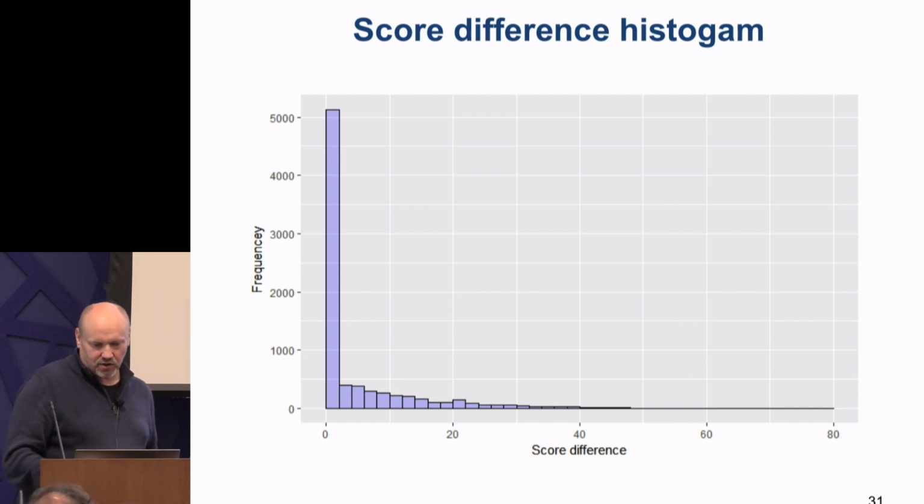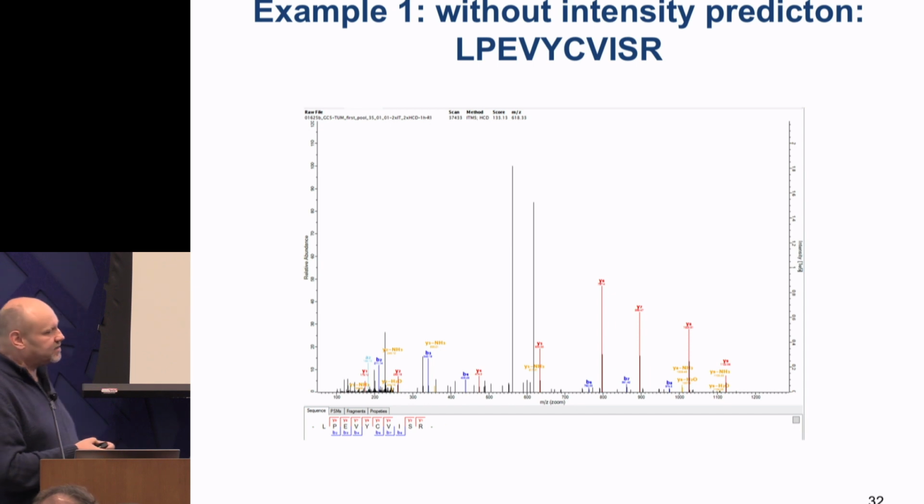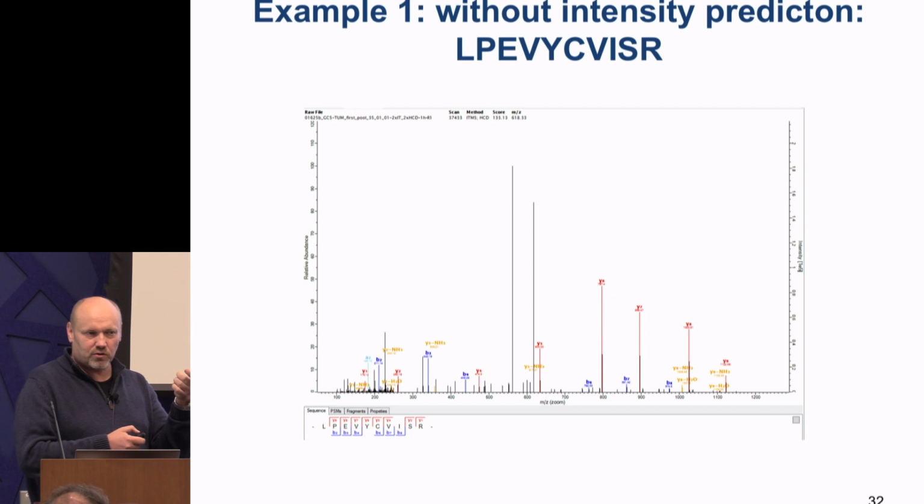And so on the synthetic data set, we actually know the ground truth, so I can just show you some examples where it's basically correcting the wrong decision it would have made with 1.0. Like here, where it's actually getting the right version of two neighboring amino acids that are flipped in the old score and that are in the correct order with the new score, right?